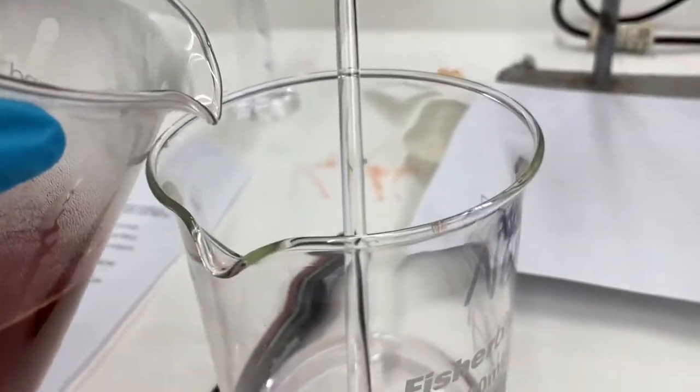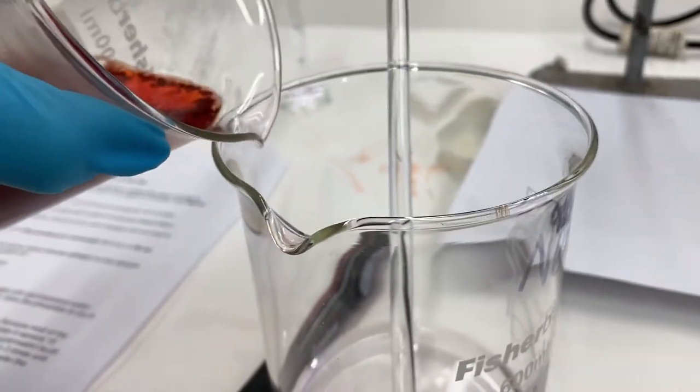Once the dye stuff solution is at the proper temperature then it's slowly added to the alkaline solution and then slowly constantly stirred with a glass rod.